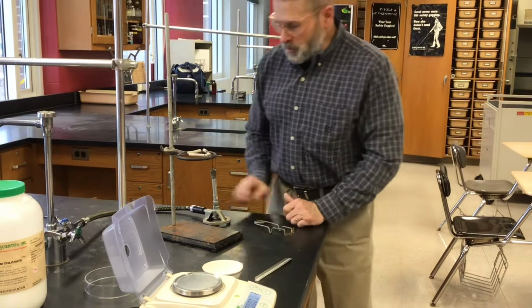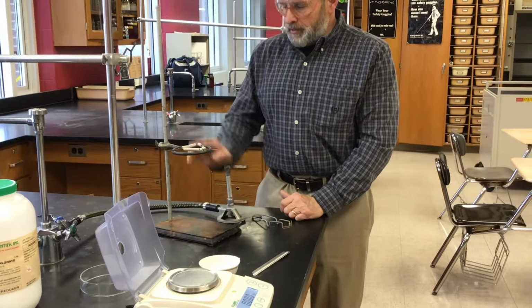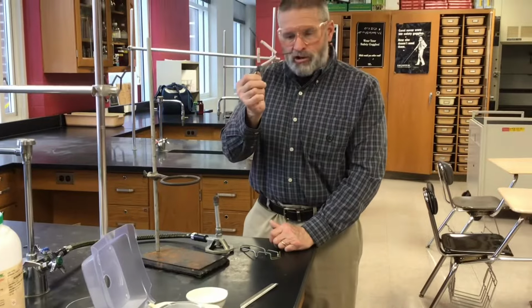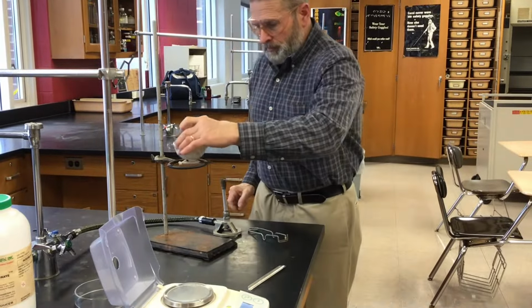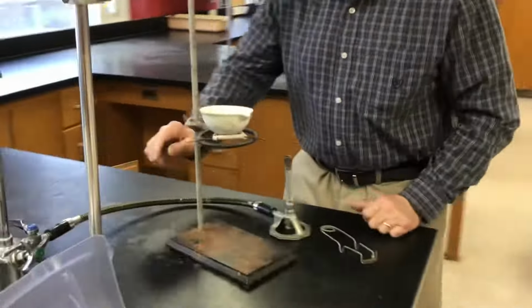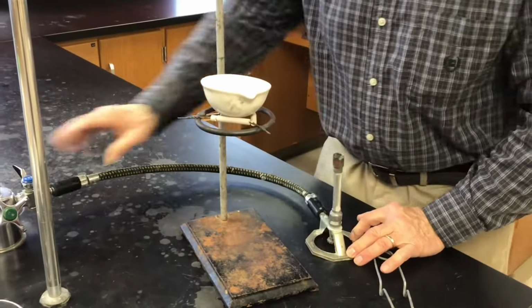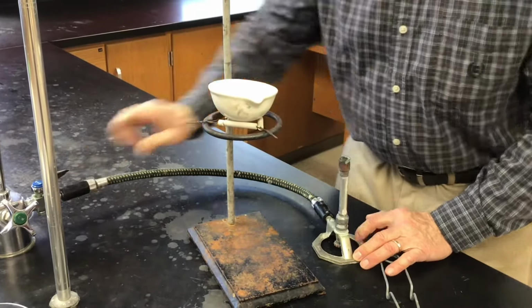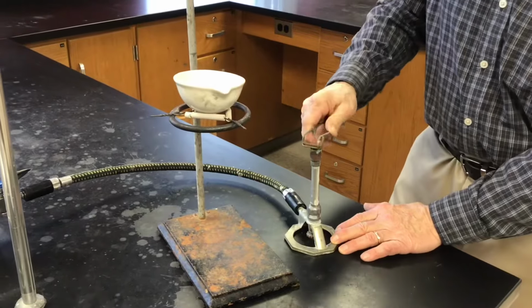To do that, we're going to use a Bunsen burner and a ring stand and a clay triangle that will hold the evaporating dish. So let's get the burner started. We're using a Bunsen burner lighter, makes a nice spark.